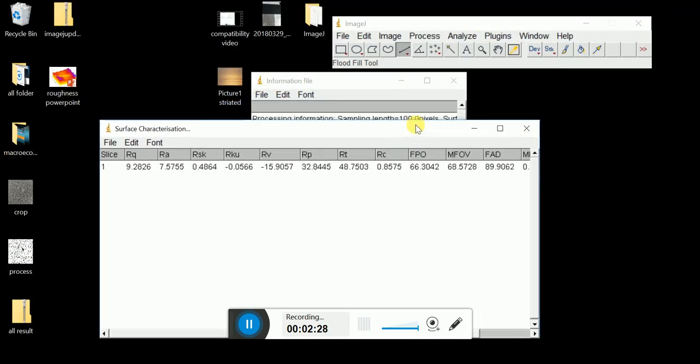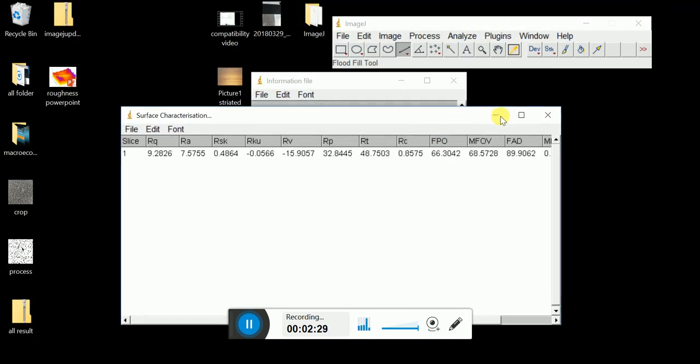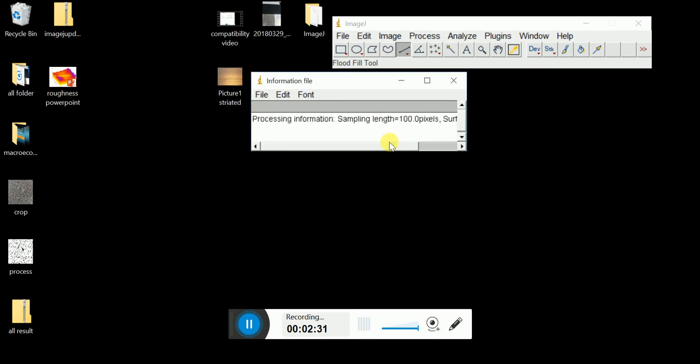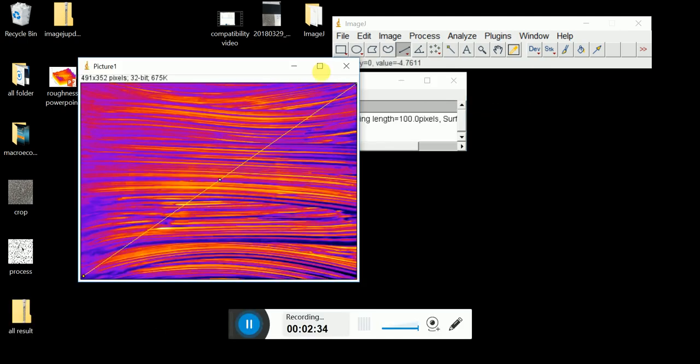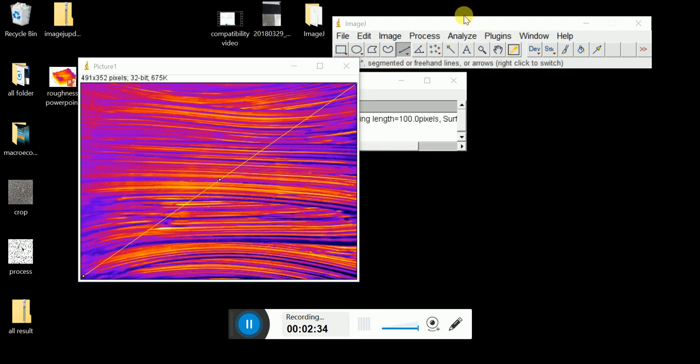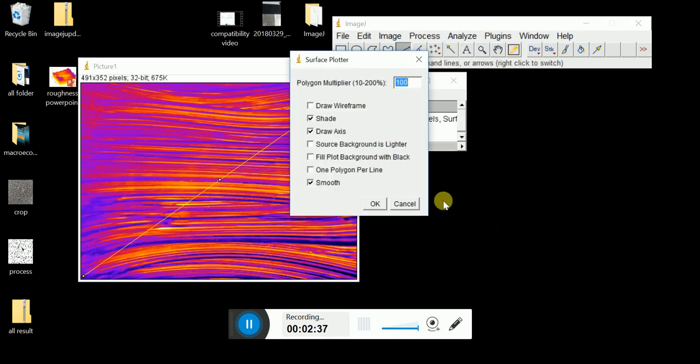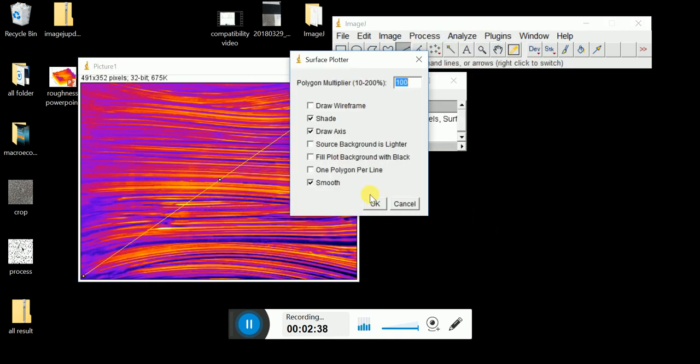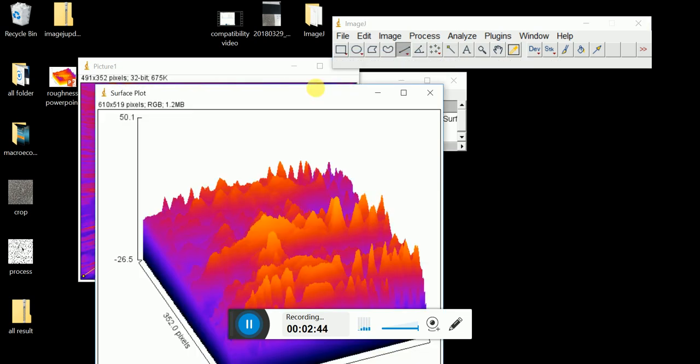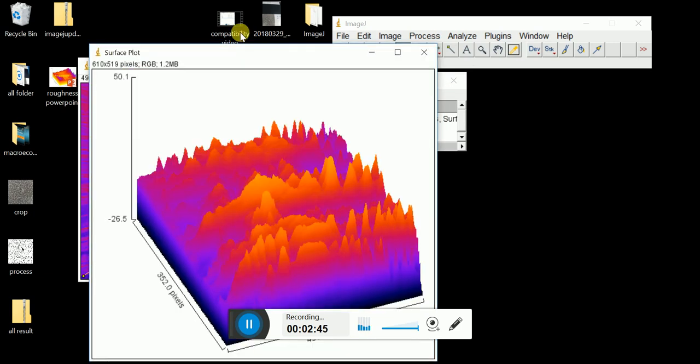So if you want to see how rough the surface is, you can just go to this profile. Click Analyze, Surface Plot. Just click Shade, Dry Asset and Smooth. So it's 100, click OK. And you can see how is the surface of the profile.